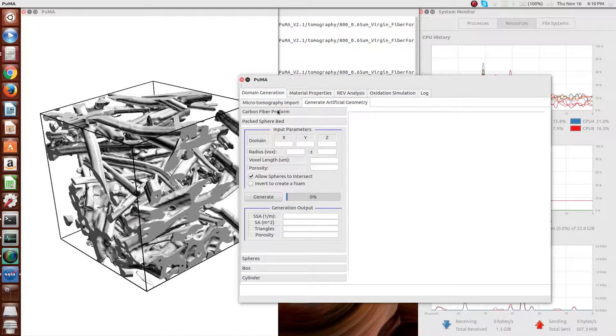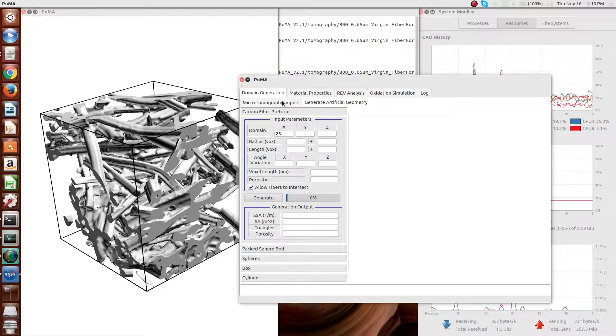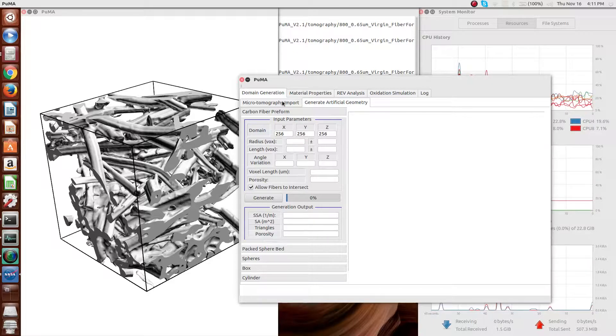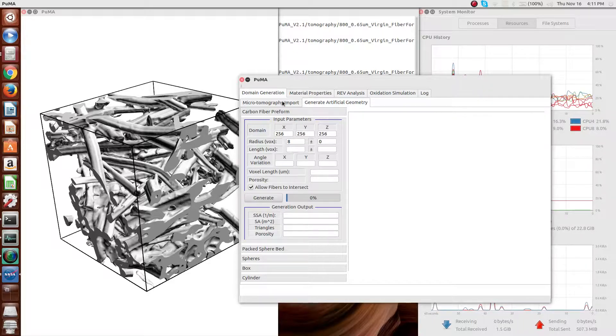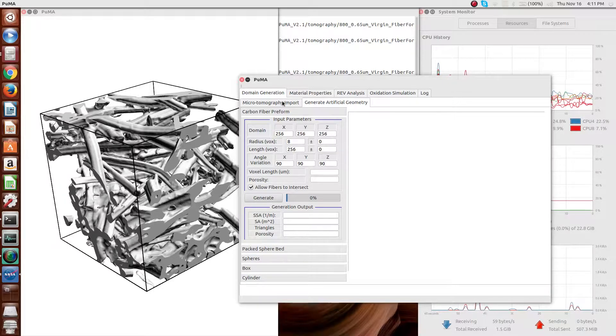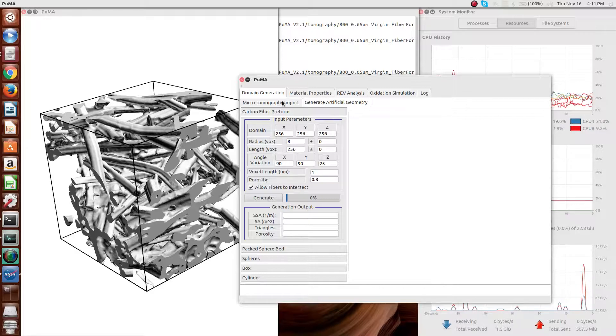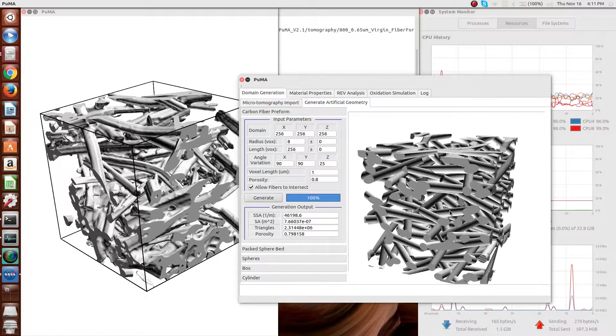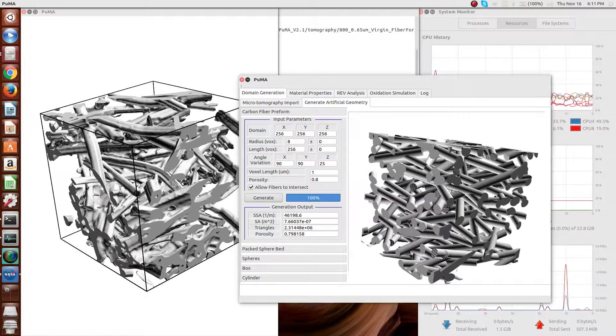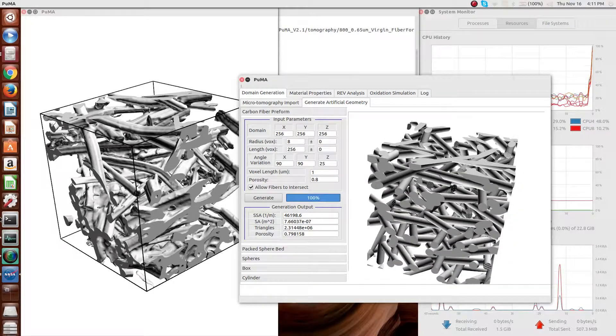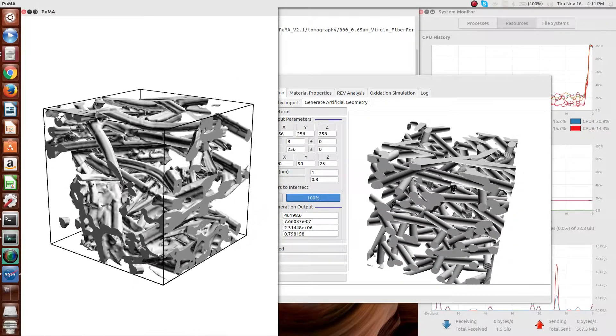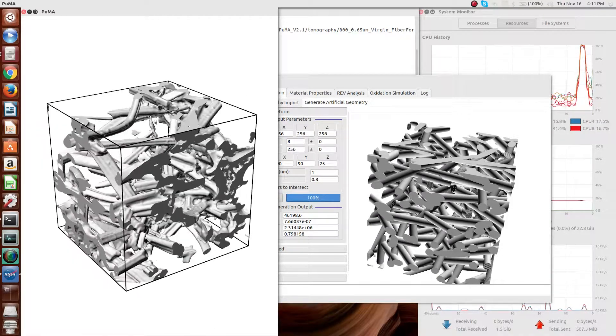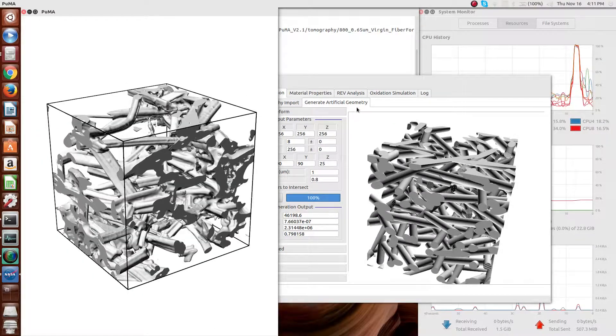For the example here, I'll generate a small sample of carbon fiber material, which you can then see here. And the idea here is to roughly mimic the structure of one of the tomographies, an example of what you see here on the left.